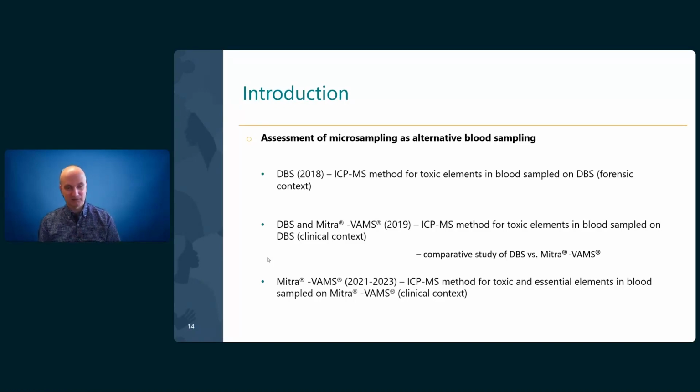Obviously, there was a pandemic in 2020, so it was not possible to have students working on projects, but we started in the fall 2021 for a master project, and the goal was to develop and validate a method for toxic and essential elements in whole blood, obviously collected on Mitra VAMS in a clinical context. So this is the history of how we started working with microvolumes here at the CTQ.